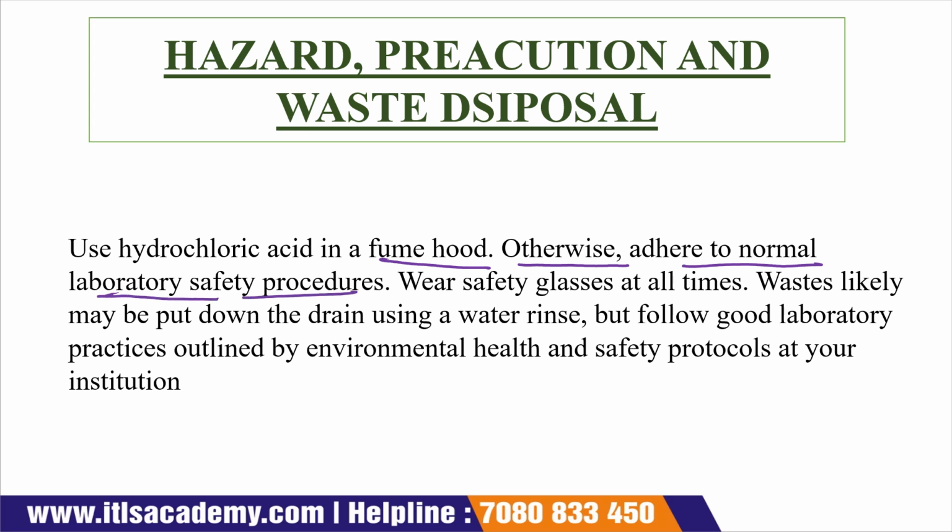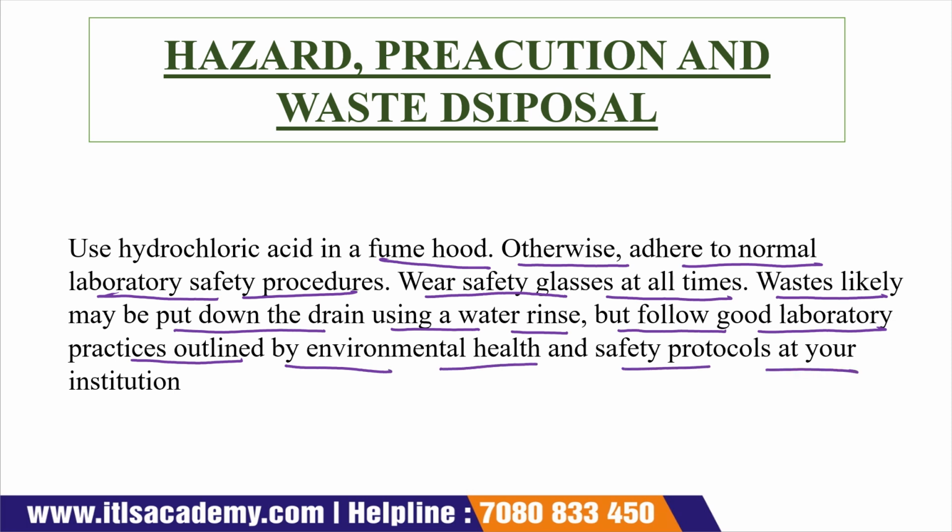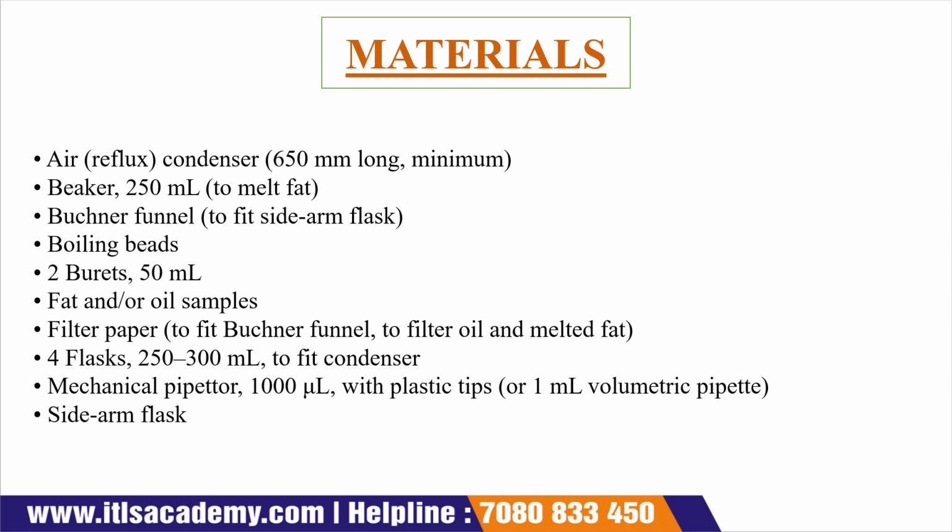Okay, one more thing that I want to add here: the chemicals that we use should be properly kept in a storage box, and we have to wear our safety glasses at all times. Waste may be put down the drain using a water rinse, but follow good laboratory practices outlined by the environmental health and safety protocol at your institution. So this is the hazard precaution and waste disposal. Now the next one is the material required for this experiment.